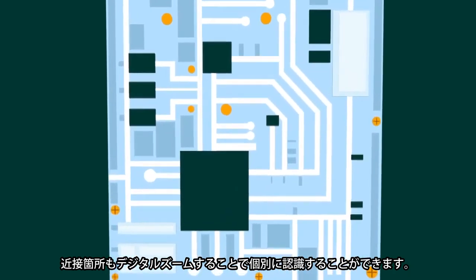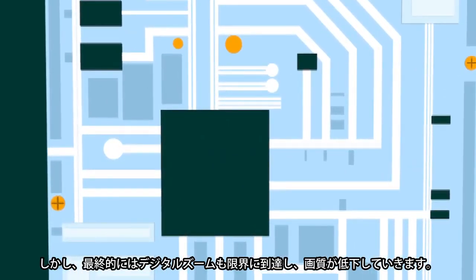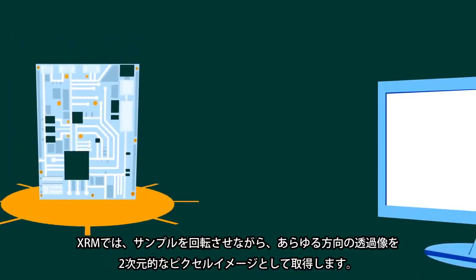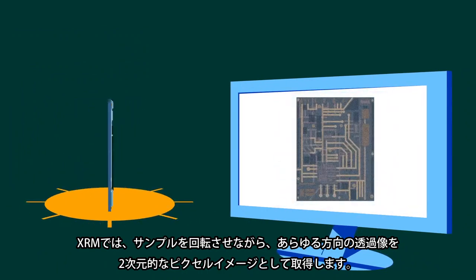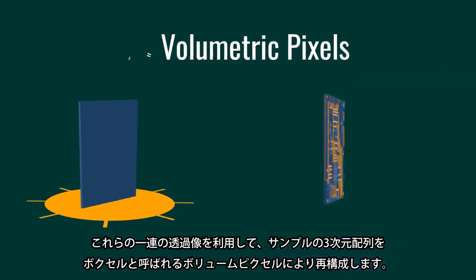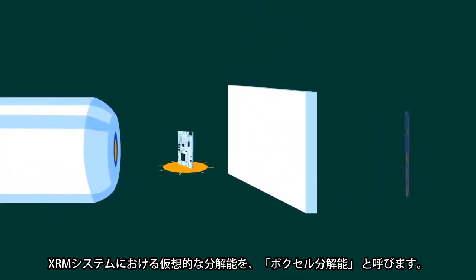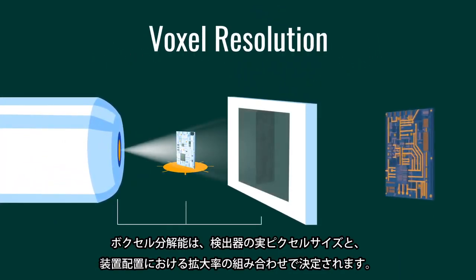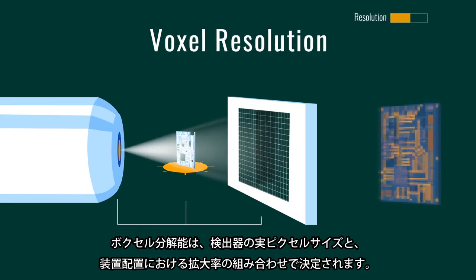Digitally zooming in, we start to see that separation again, but eventually the limit of digital zoom is reached and the clarity starts to degrade. In XRM, a series of 2D pixel images are acquired at different rotation angles. Using this image sequence, a model of the original sample is reconstructed as a 3D array of volumetric pixels, known as voxels. The ideal resolution of the XRM system, referred to as voxel resolution, is determined by the pixel size of the detector and the magnification of the instrument.